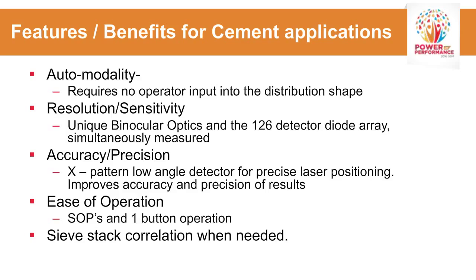And then lastly, ease of operation. Most of these systems have built-in, or you can create, SOPs or standard operating procedures, and essentially allow a one-button operation for your particle size analysis. So these instruments can be used by production people.